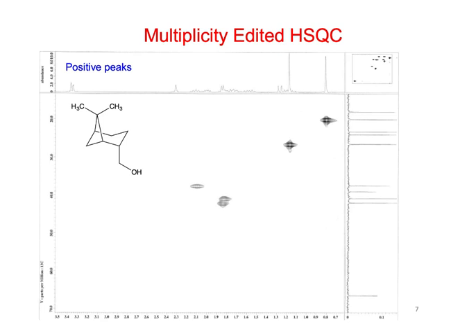So these are the CHs and CH3s, right? And notice we're missing all the CH2s.